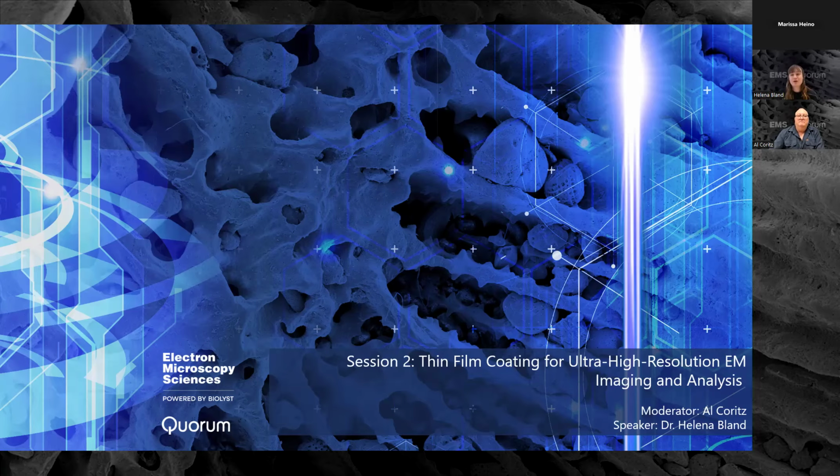I'm an application specialist at Quorum Technologies, and this is our second session in our three-part webinar series on sample preparation for electron microscopy. Today, I'm going to be focusing on thin film coating for ultra-high resolution electron microscopy imaging and analysis.